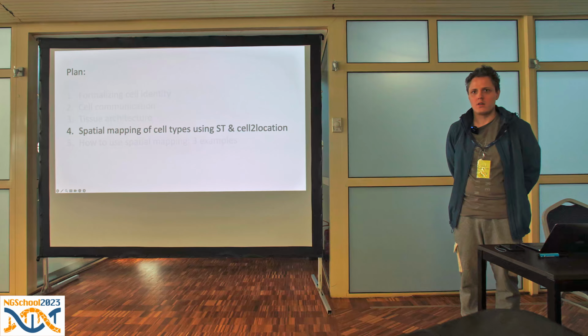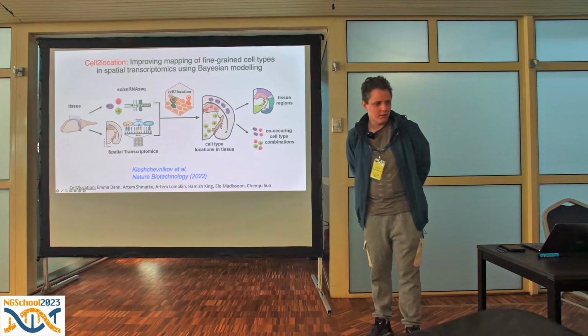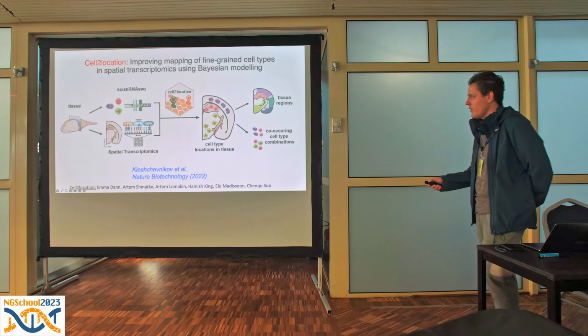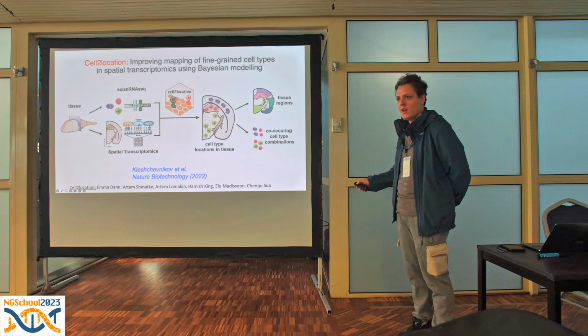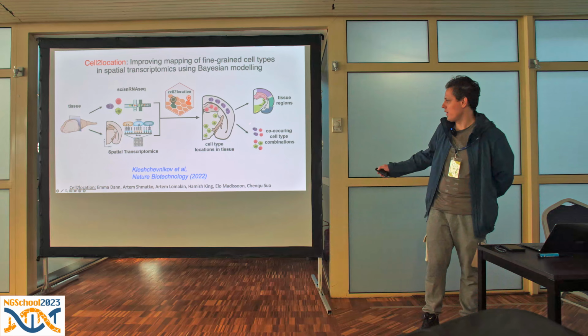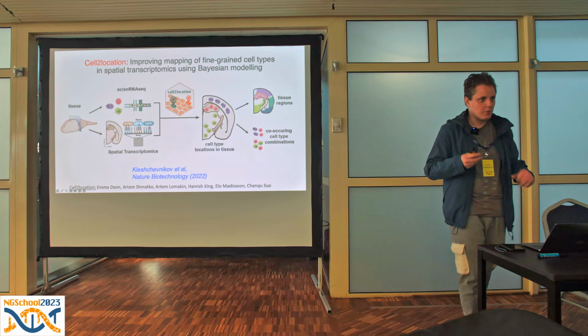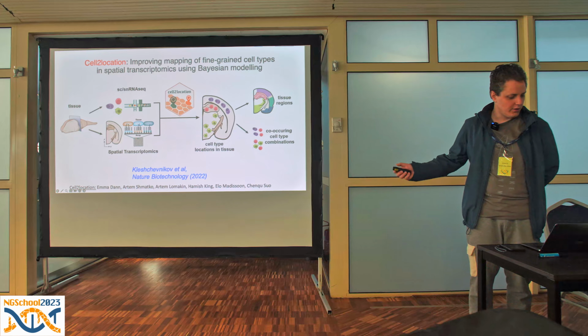Okay. Cool. So now we get to the main point, and the main point is about how we can use single cell and spatial transcriptomics data to establish comprehensive spatial maps of tissues, and then analyze those maps to get at either the tissue architecture point or the cell type collocation point. And this was the focus of our work that produced the cell2location paper.